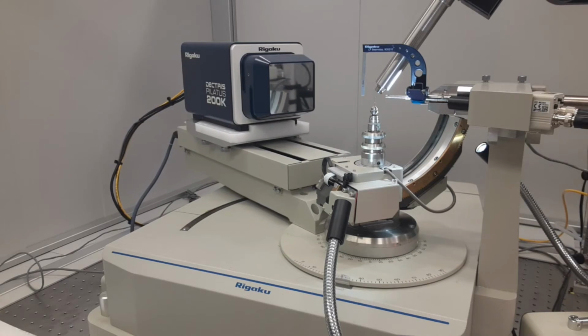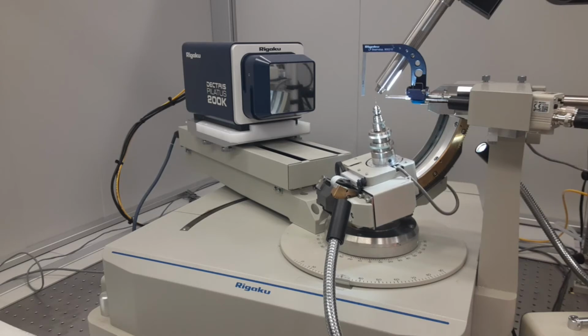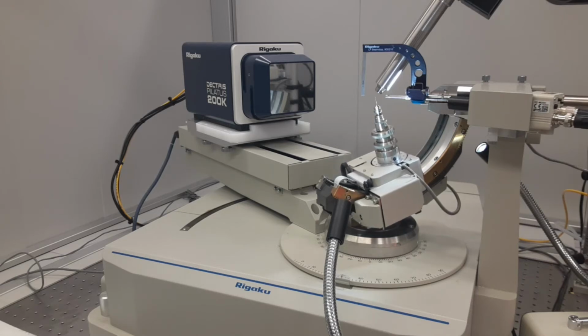And 2 other axes of rotation are chi and phi. And what those allow you to do is to collect all your HKL reflections. And there's a Rigaku strategy program that determines the best crystal orientation. And by moving chi and phi and holding those steady during the experiment, you can get more efficient collection of all the spots. So I'll move chi, and that moves the small goniometer itself up the ramp there. You can see it go up to about 30 degrees.